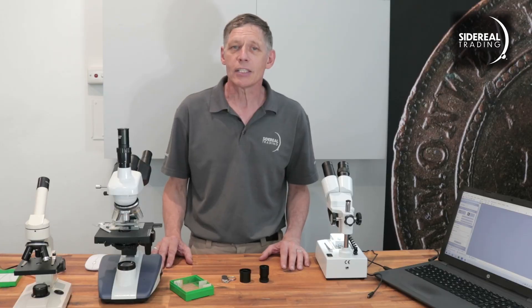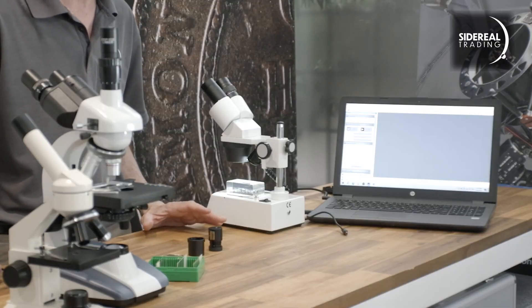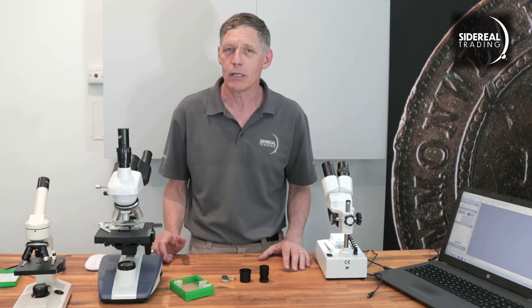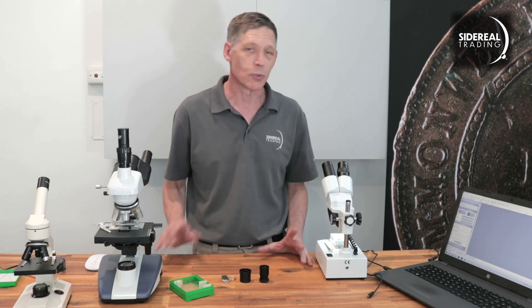For a lot of our clients there's a good chance that you've got a halfway decent microscope already. What we're going to do here is to show you how to put a camera on a standard microscope and get some images on your computer.